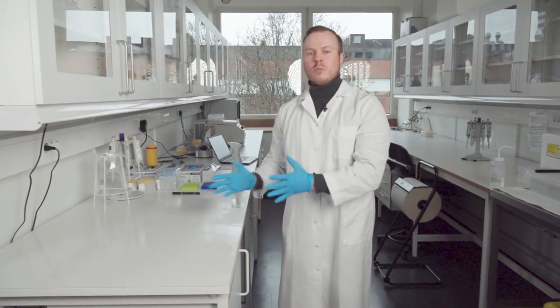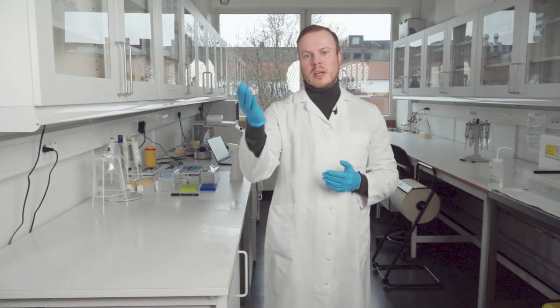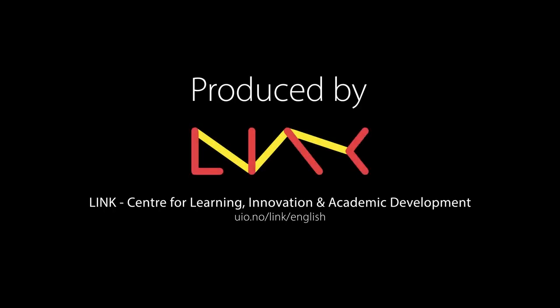Now that we have a clean working environment, we can start organizing what we need. But we also need not only a clean but a sterile working environment when we are going to do PCRs, especially on bacteria. This leads me to the UV cabinet and the sterile bench, which is over there.